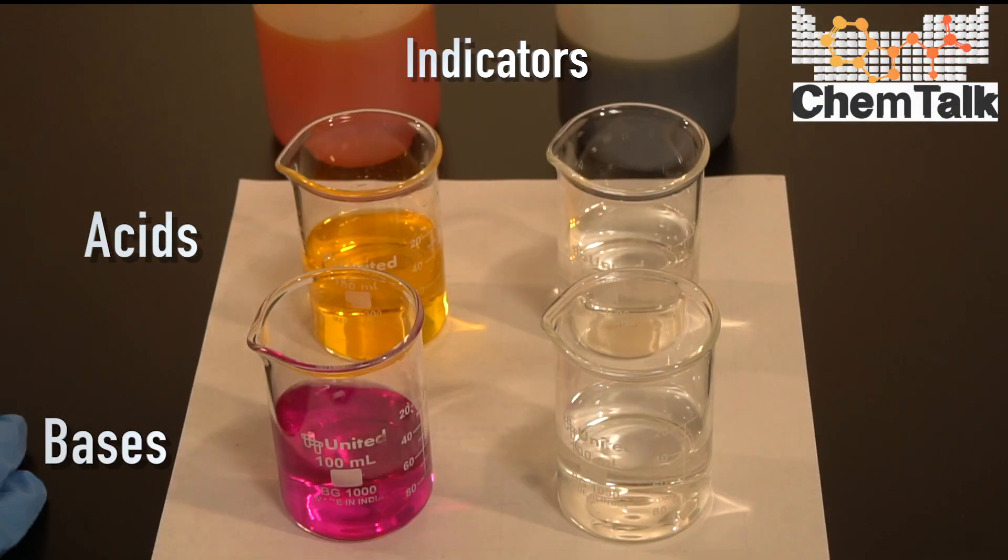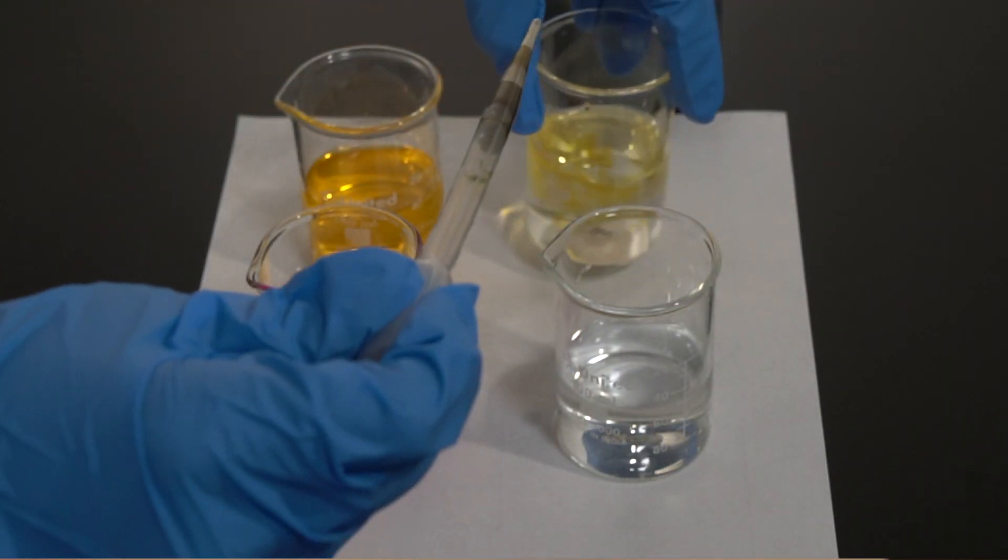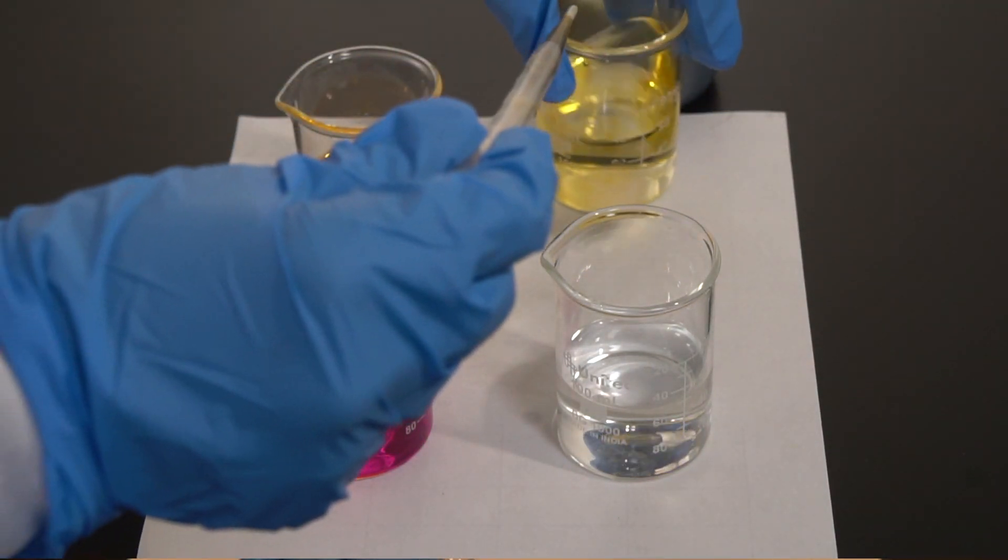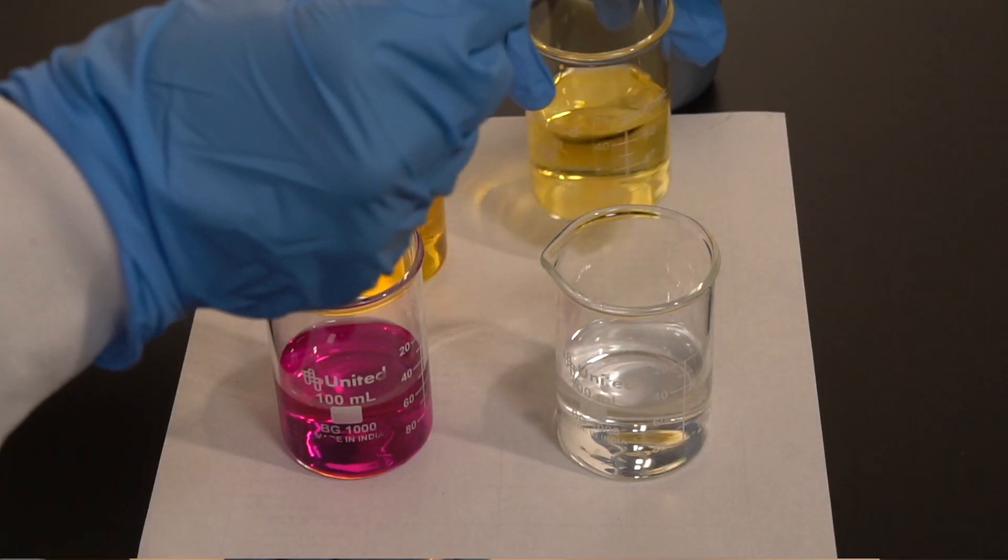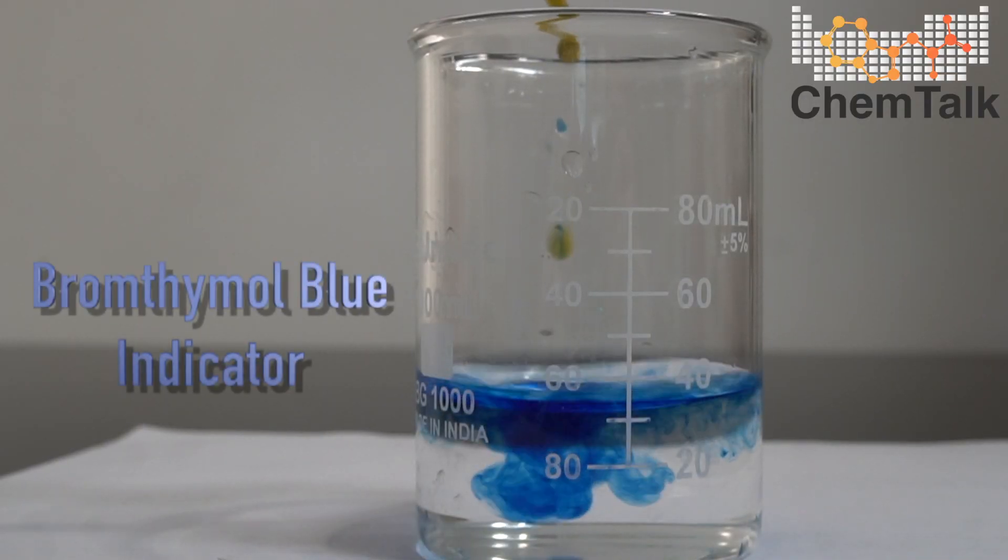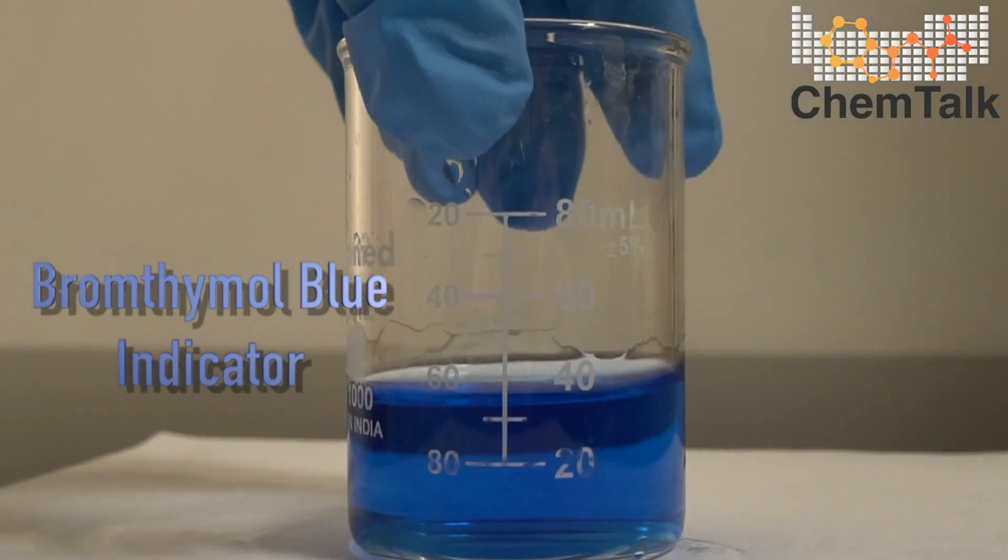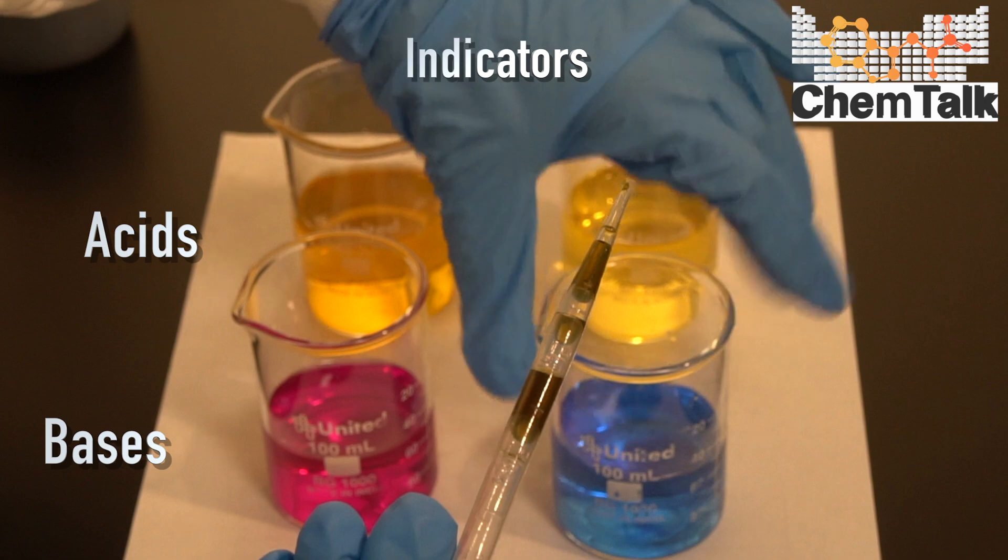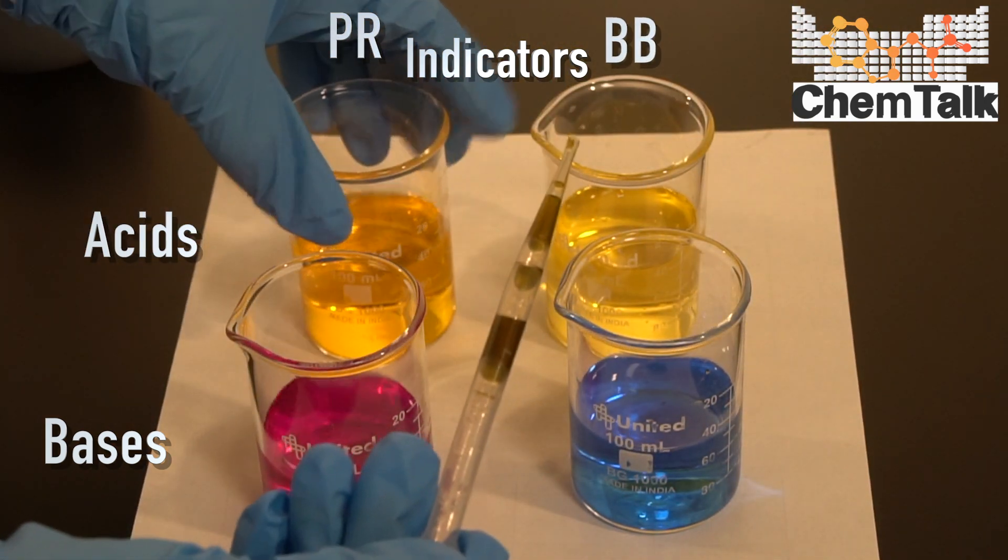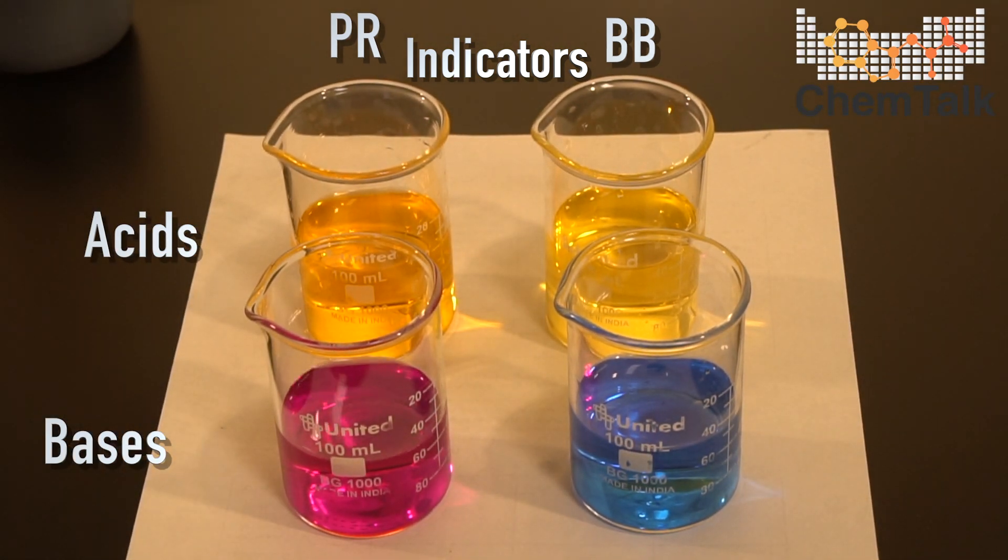So now for the bromothymol blue. So first into the acetic acid, looks like that's also going to be yellow. All right, so our acids are yellow. It's a little more pale yellow. And potassium hydroxide. So we got that dark blue color for our base. So again, phenol red on this side, bromothymol blue on this side. So this is what we need to compare it to when we look at our soil samples.